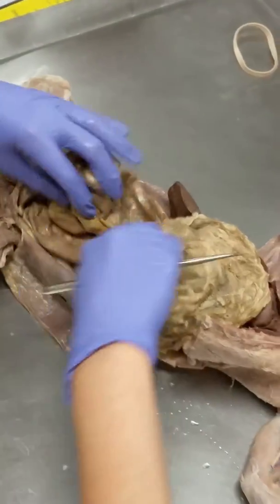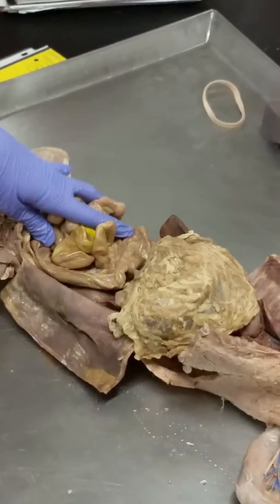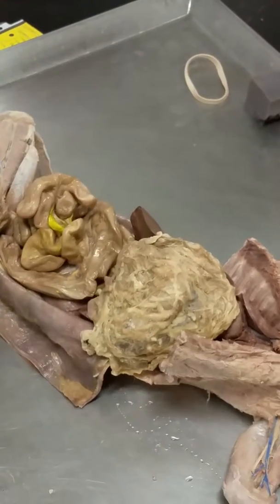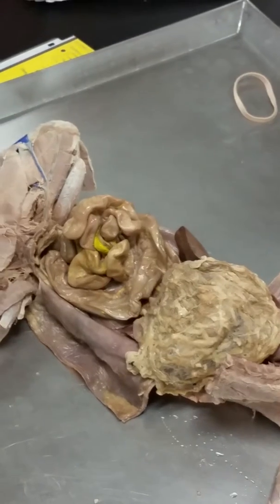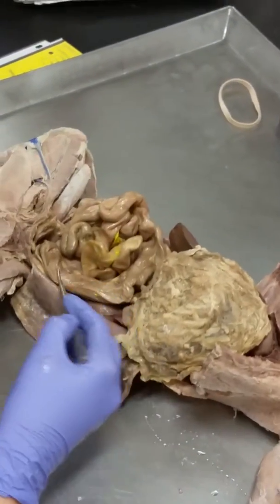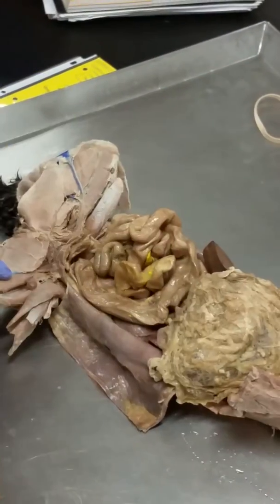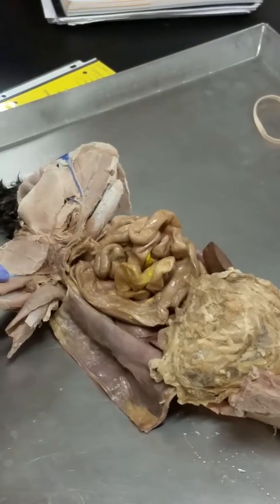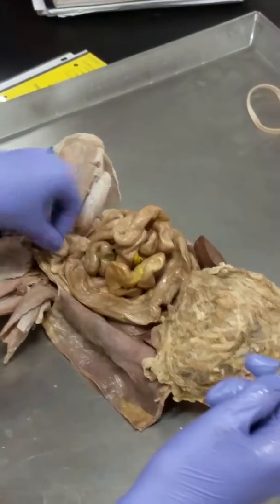Okay. So if you notice, this descending colon is off on the side over here, but our anus is right in the middle. The sigmoid colon is the part of the colon that does a little jiggly move to get into the middle. It's just a little squiggly. We can't see it in the cat, but when we look at the cadaver, you'll see it. It's this squiggle that it does to get into the middle. And then the rectum is everything after that squiggle. So I don't do either of those on cats.